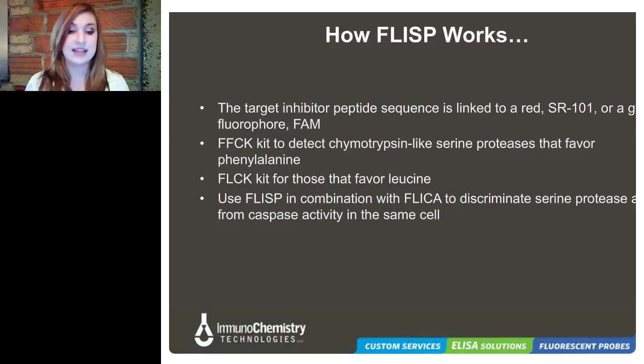Cells containing lower concentrations of chymotrypsin-like enzyme activity will retain a lower level of fluorescence compared to the cells containing higher concentrations of this effector enzyme component. There's no interference from proenzymes nor inactive forms of this enzyme in this particular assay. Now, if your treatment is activating chymotrypsin-like serine proteases, positive cells will fluoresce brighter than the normal baseline negative cells, allowing you to clearly differentiate these populations.